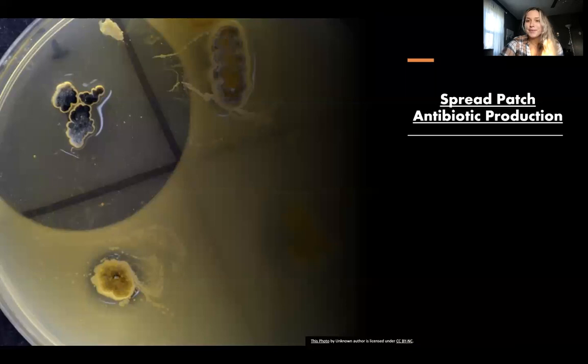Next is my favorite part - the spread patch antibiotic production. This image is a perfect example showing exactly how you can tell if you have a positive antibiotic producer. This halo-like ring you can see surrounding this bacteria shows that the bacteria is able to ward off anything that comes near it, and that's positive antibiotic production.